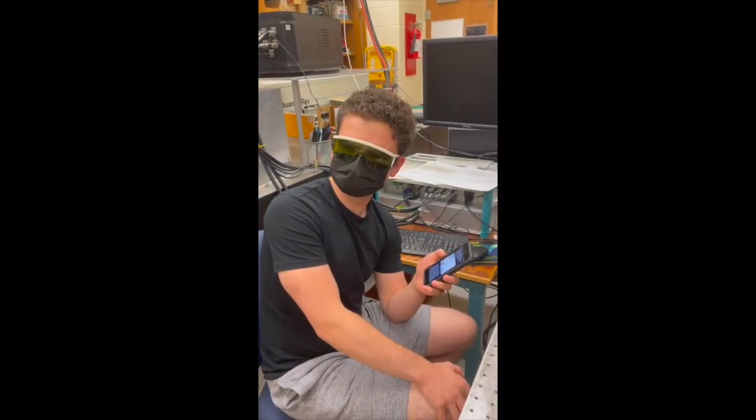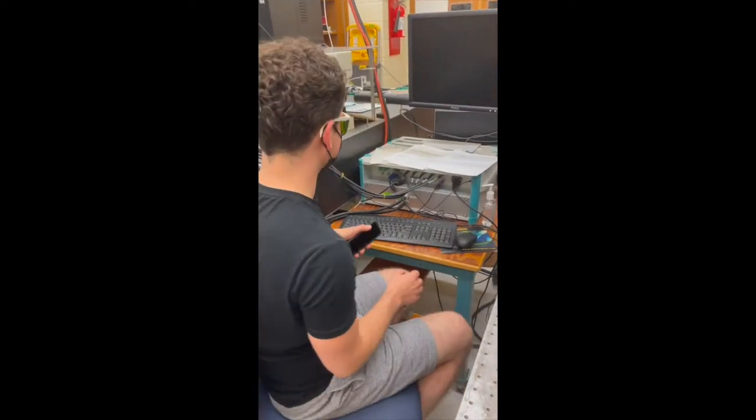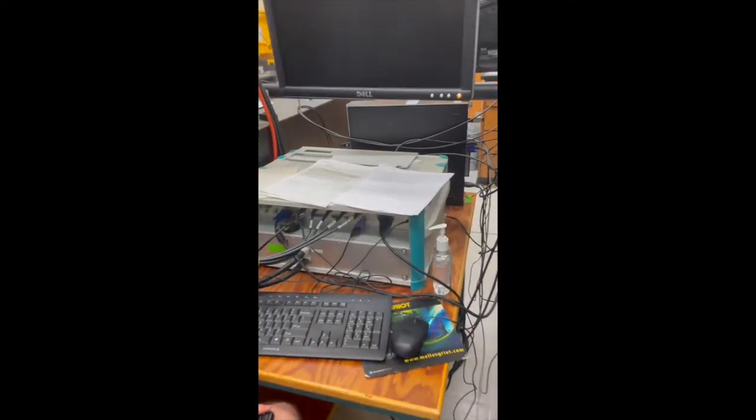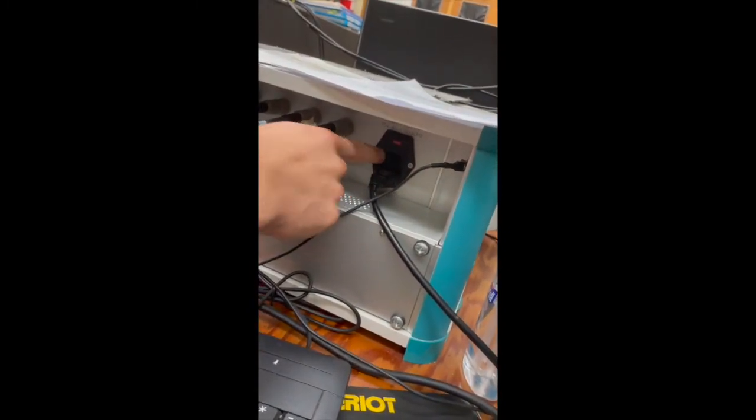Well, we can go ahead and do that. So the first thing we have to do is turn the spectrometer on. And that switch is actually a little bit hidden and hard to find. So it's right on the back there underneath the power plug. Press that.